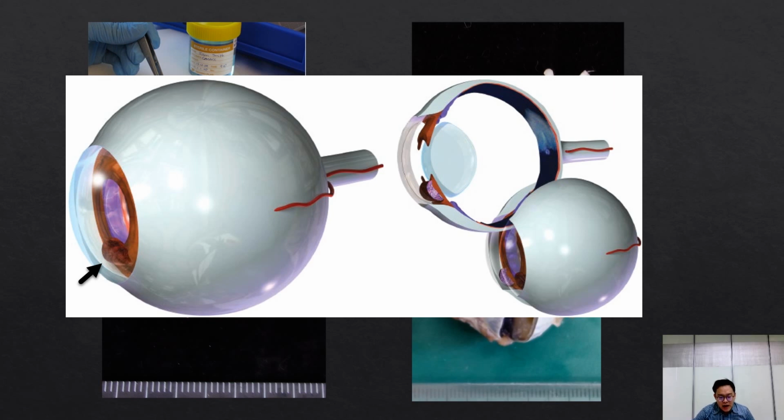This is how we trim the globe superior to inferior, cranial to caudal, and take the central section with the optic nerve into cassette. Basically, anything that could be biopsied of the dog all comes to the trimming lab. They will be responsible for preparing the tissues for processing and then giving it to the pathologist.